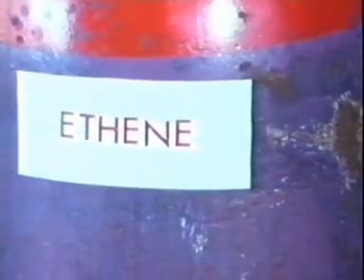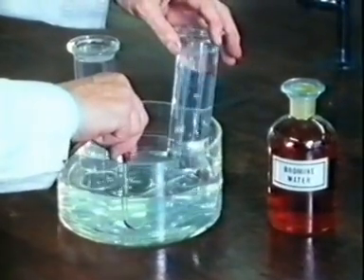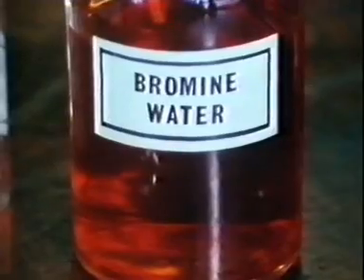This cylinder contains the gas ethene, C2H4. We'll collect some over water in a gas jar. You may have seen the reaction when ethene is shaken up with bromine water, which is coloured.